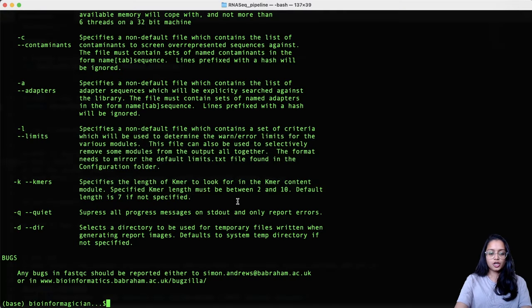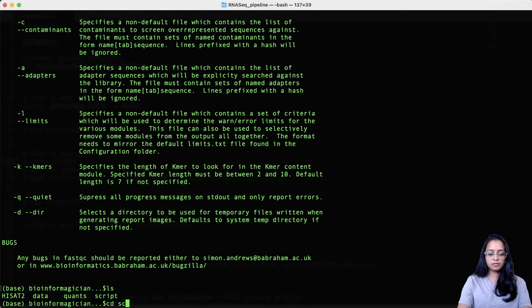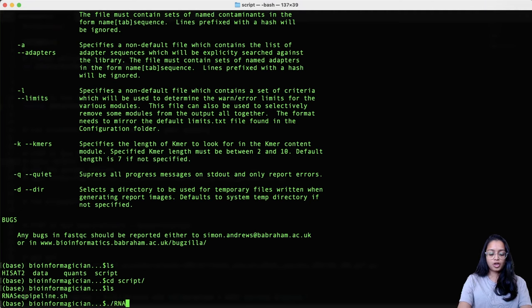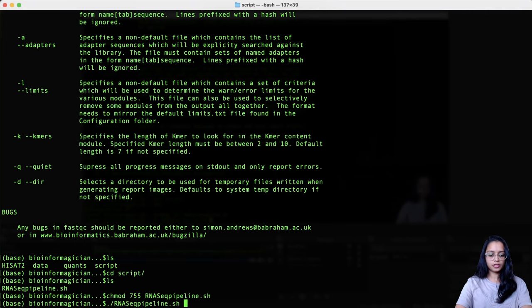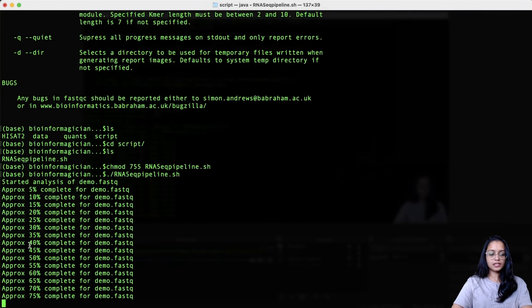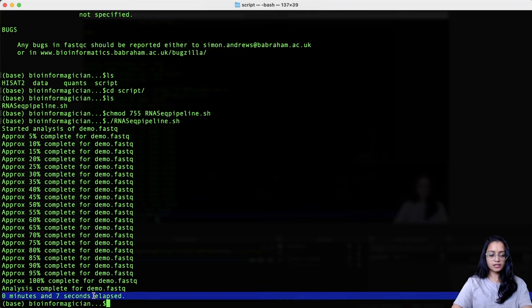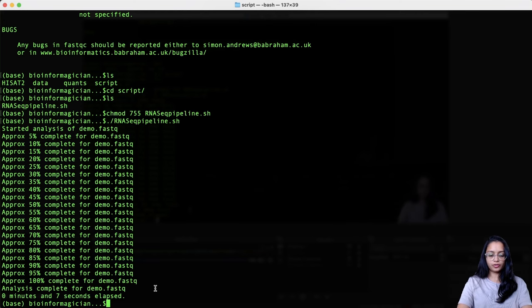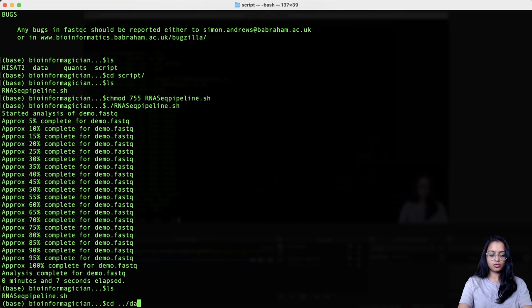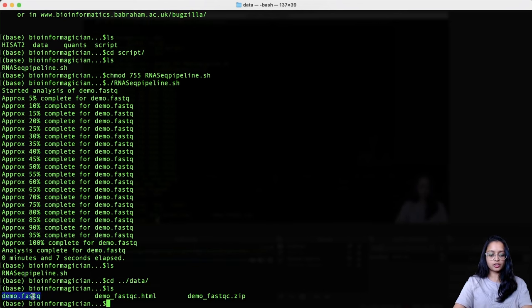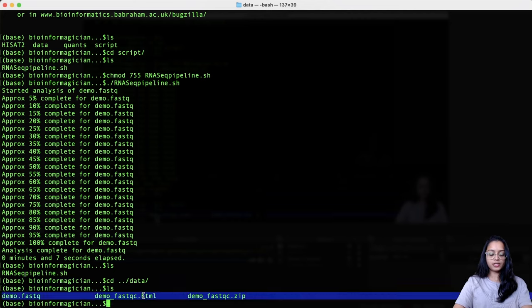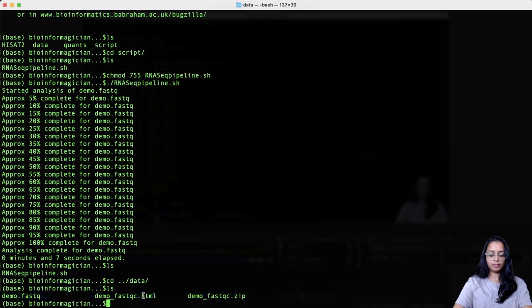I'll save the script and go to the terminal. In the terminal, I'll navigate to my script folder and run the pipeline — make sure you've given permissions to your script first. It tells us how much percentage it has completed for the FASTQ file, and finally reports analysis complete. It took 7 seconds to run. Checking the data folder contents, we see two new files: a .html file and a .zip file. The .html file is the FastQC report, viewable in a web browser.